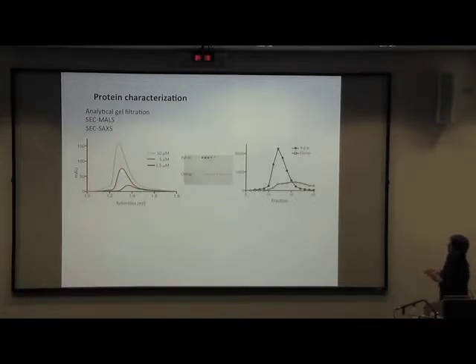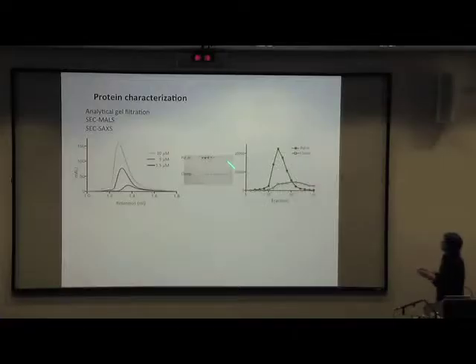These are 3 different concentrations of a dimeric protein complex. Although this middle one looks like a single peak, and this is what I mentioned earlier, you'll be inclined to take everything because that's more protein. If you run it out on a gel, and in this case we quantify it, we find that much of the smaller protein is actually spread out over a large population, which means that this is the unbound protein and that's the bound protein, which in other words means that this is not a fully occupied complex. So we get some information out of this.